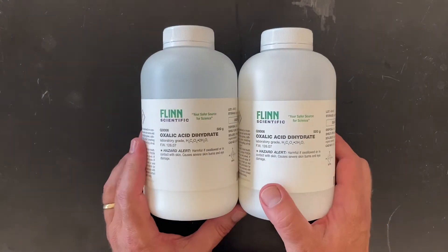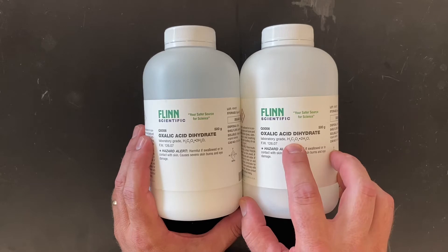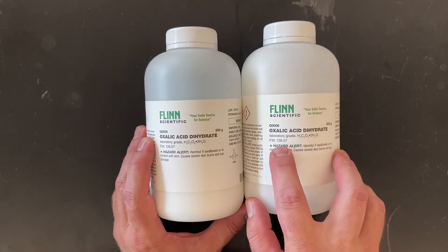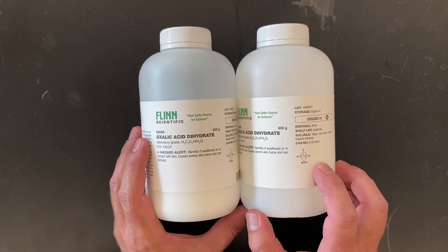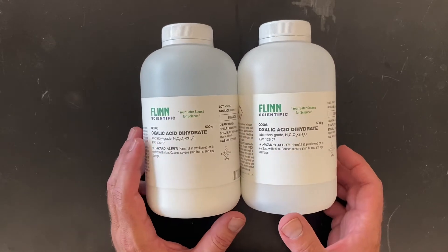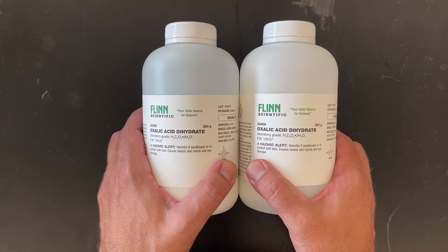We also have some oxalic acid, and this is a dihydrate. In the formula you'll see the formula for oxalic acid plus the dihydrate part — there's water actually stuck in there. The formula weight is listed, along with the hazards. One of our jobs as chemists is to get used to reading the labels of those bottles and making sure we're doing things that are appropriate with them.